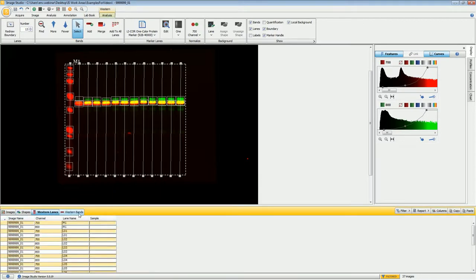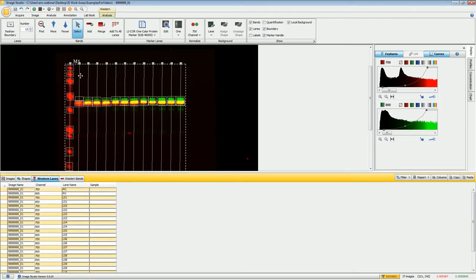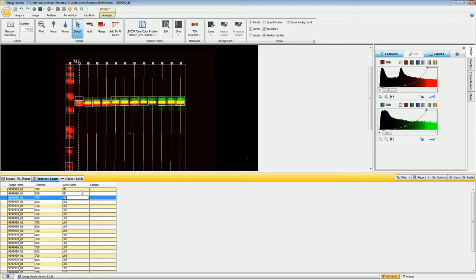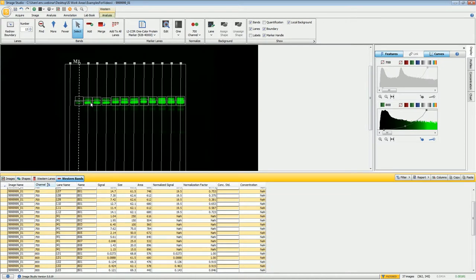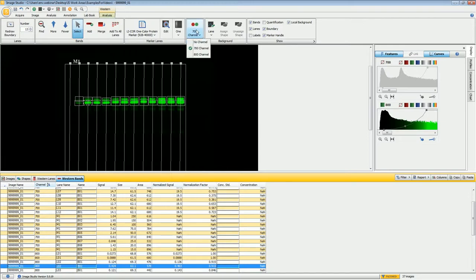Coming down to the two new tables, the Western Lanes table gives you information on the lane itself. Under Lane Name you can change the default name to a sample name, and that name carries over to the same Lane Name column in the Bands table as well. So if you label your samples here it will be kept in the Bands table too. The molecular weight is represented under the Size column, and the Signal quantification is the same calculation used with shapes.